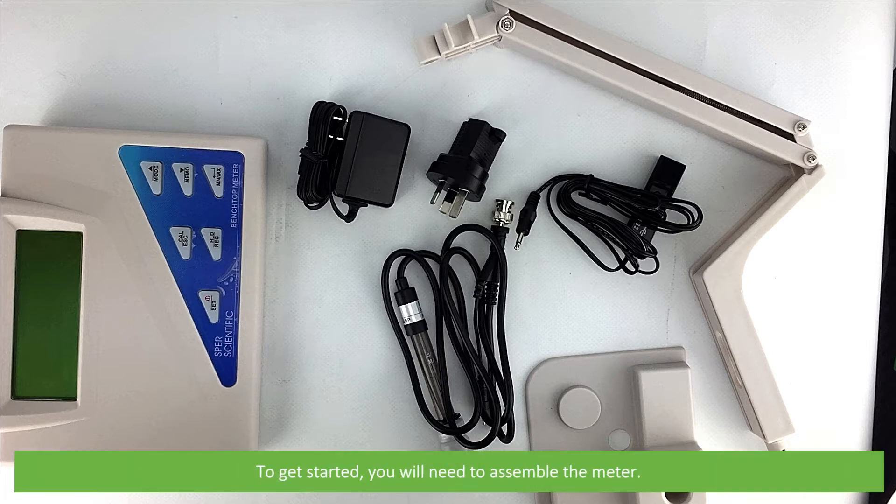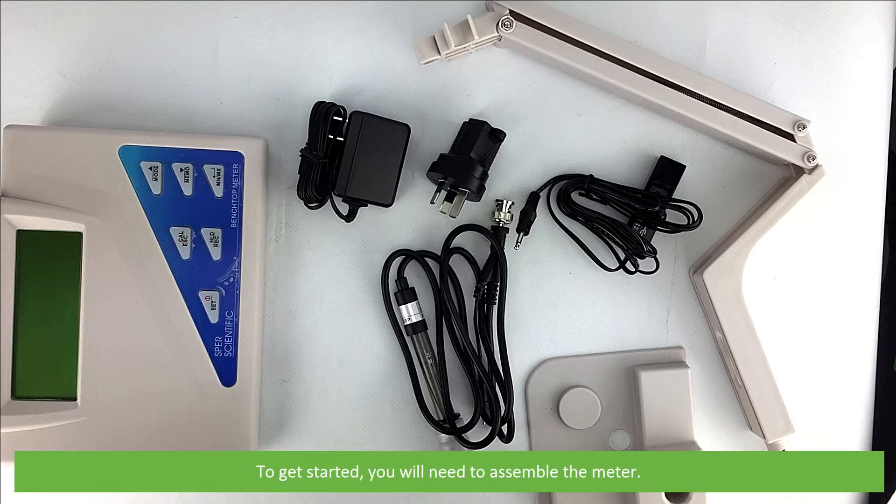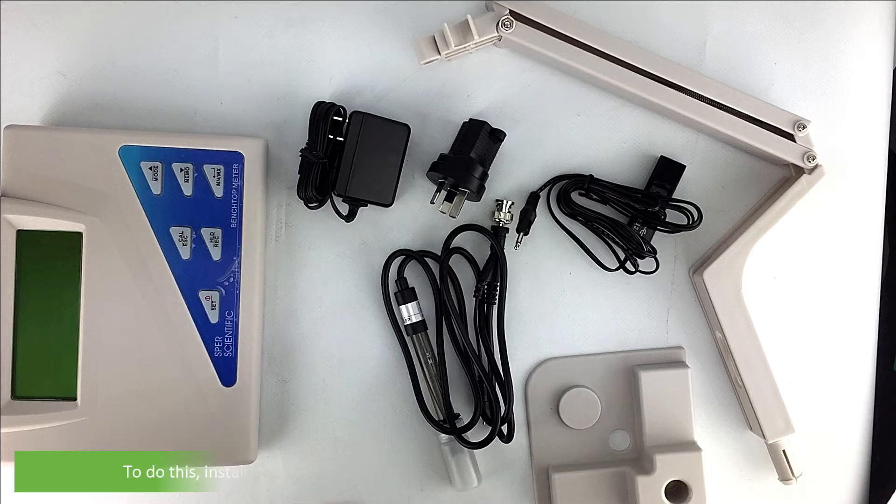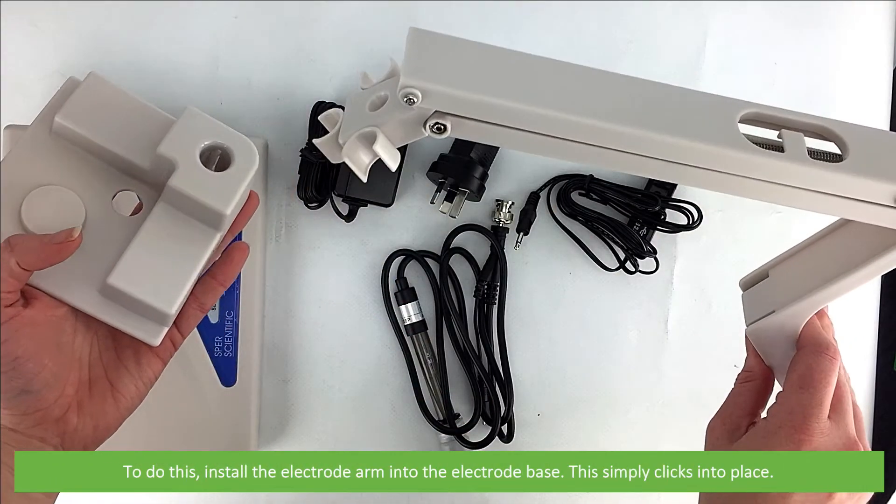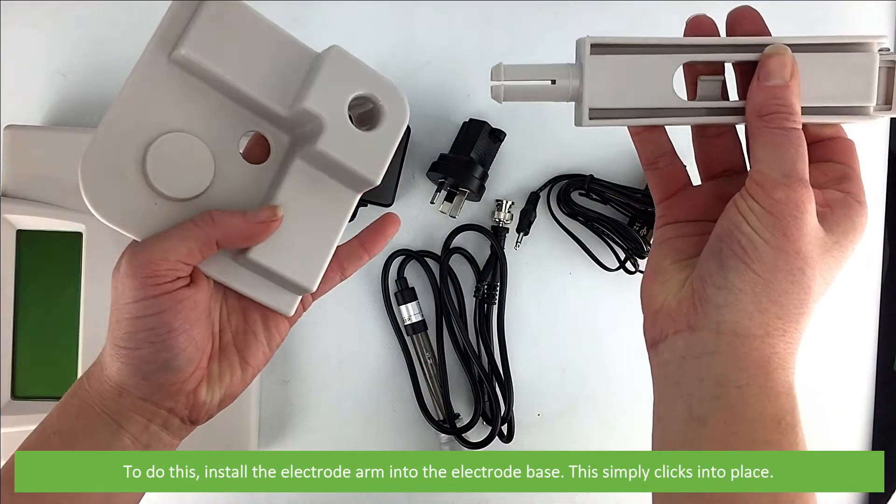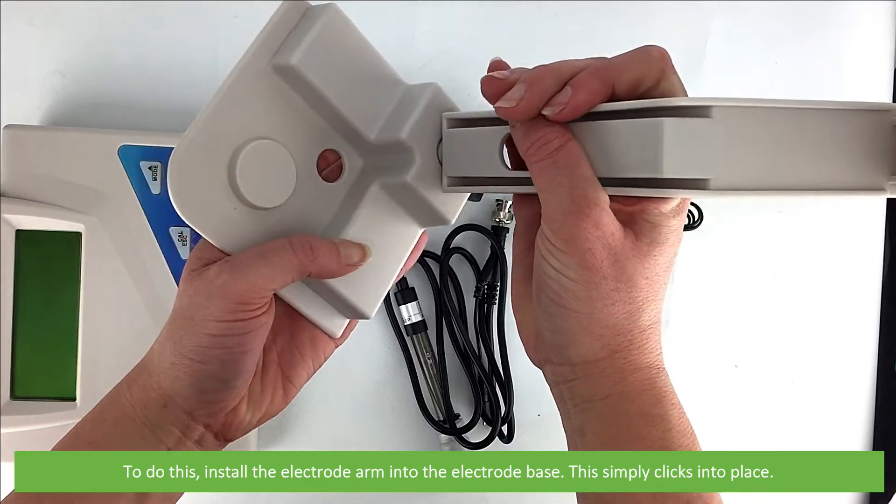To get started you will need to assemble the meter. To do this install the electrode arm onto the electrode base, this simply clicks into place.